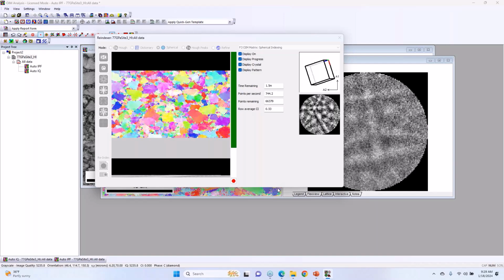Bandwidth. I did it because the patterns look pretty good. If you remember what that bandwidth does, when you transfer to frequency space, it's basically a low pass filter. As we decrease that number, we're getting rid of more of the detail. So when I have nice looking patterns like this, I want a match with a little bit more detail, and it should match a little more precisely.